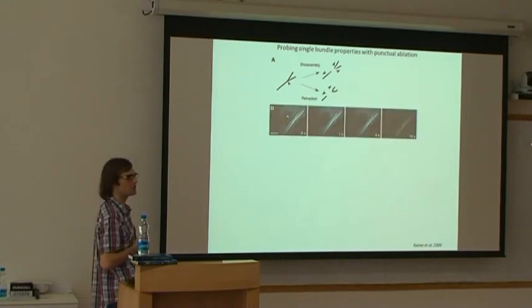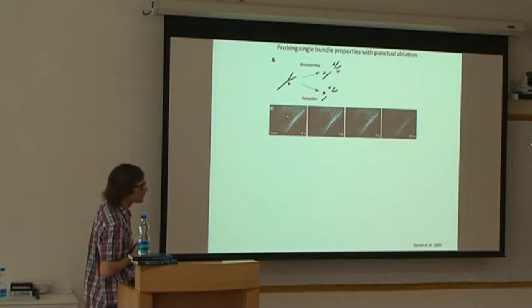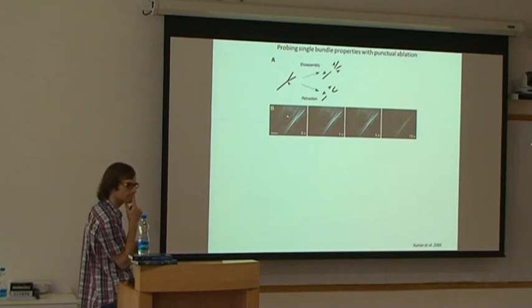You have to have very good eyes to see that. But if you look, this fiber here starts from here, and then right here, it's divided into one up and one below. And here's exactly where he will do the dissection. And then you will see here's the dissection. You will see in time that this part above will stay exactly like this, showing in fact that most likely you have retraction. Possibly still disassembly, but certainly retraction.